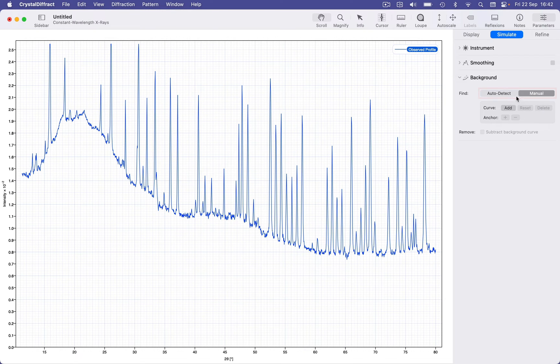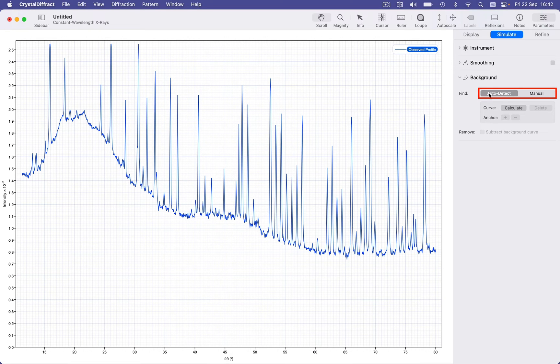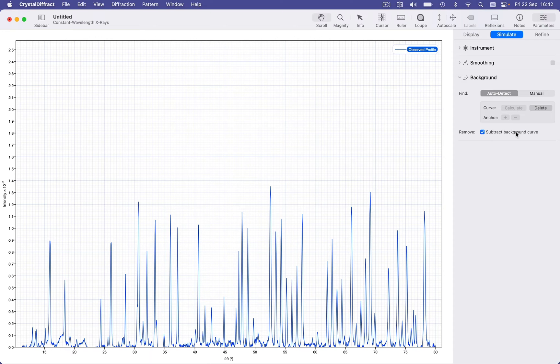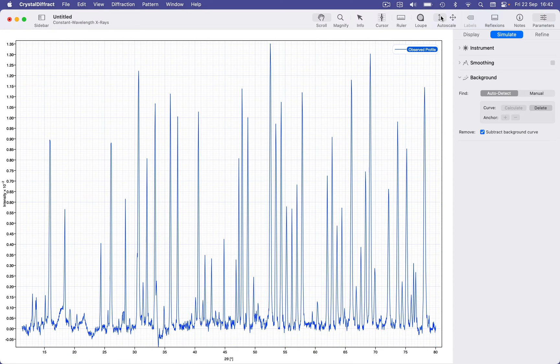Let's remove our manual curve and have a look at auto background detection, which is probably what you'll use most of the time. Simply choose the auto detect option and click calculate. When finished, we can opt to subtract the background curve and auto scale at that point.